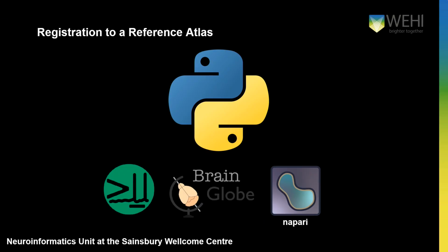And this was a really cool Python ecosystem that was developed by the Neuroinformatics unit at the Sainsbury Wellcome Centre. And it's really great because it holds a lot of tools for analysing whole brain data sets, from brainreg or BrainGlobe registration, which registers your data sets, to CellFinder, which is a cell detection tool, and also BrainGlobe segment, which can segment out different structures of the brain. And all of these tools have a napari plugin, and napari is also another open source Python tool, which is really, really great for viewing multidimensional data, particularly images, and it's used a lot in bioimage analysis.